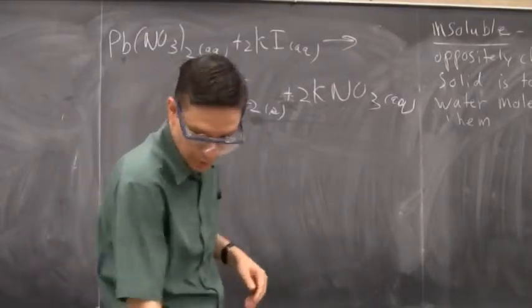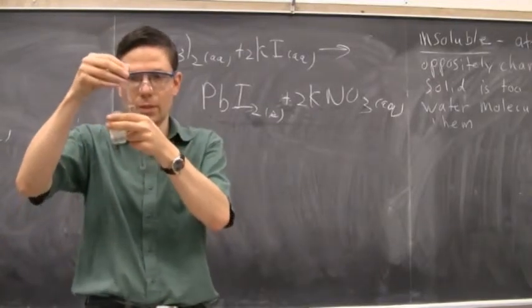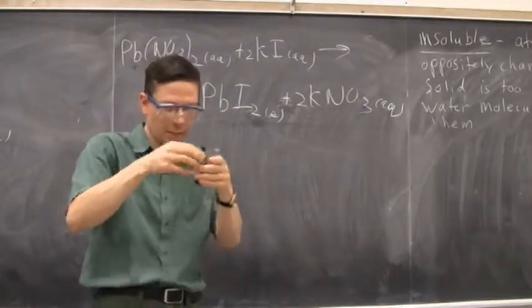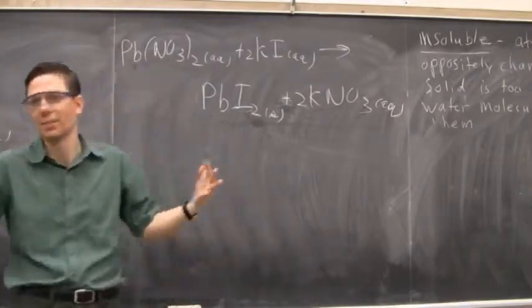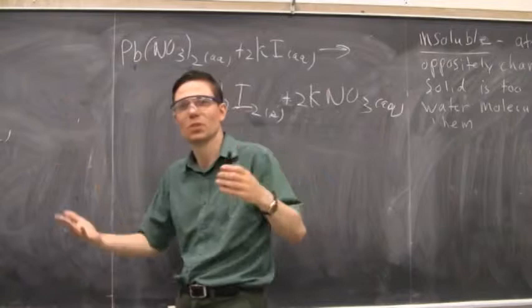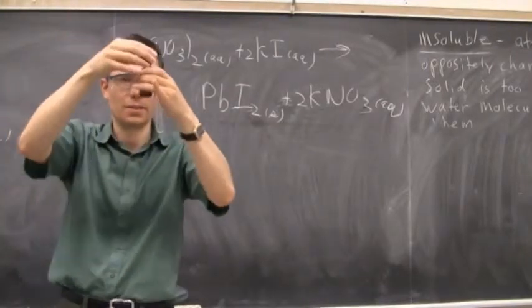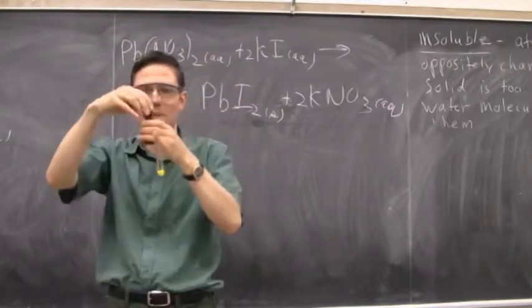All right, so let me actually do the reaction here. I'll put the lead nitrate in this test tube first. Okay. And before I actually add the potassium iodide, which is in this brown bottle here, what do we think the color is going to be? It won't be white. I'm not going to bore you with just a paltry looking white color. What do you think it'll be? Blue, pink, yellow. Well, let's see what happens. All right, so add it. Yellow. There we go. That's 5 points.